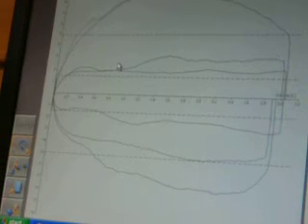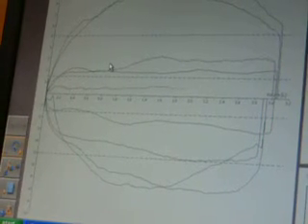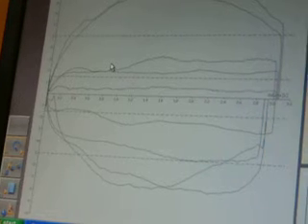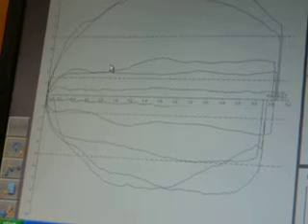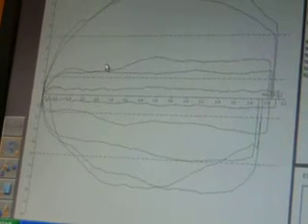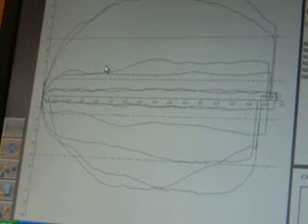So I need another big one. Another big one. And then the small, low flow rates. And it looks like this first attempt is going to be a little bit out of range. So then you will have to repeat the calibration.